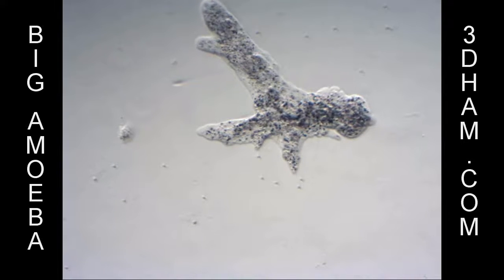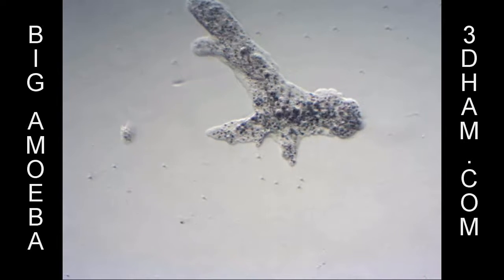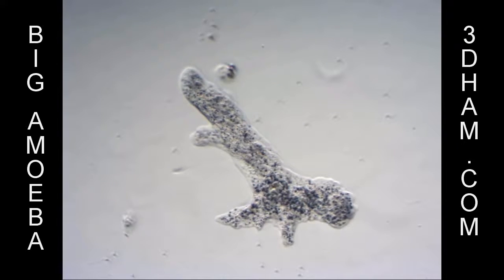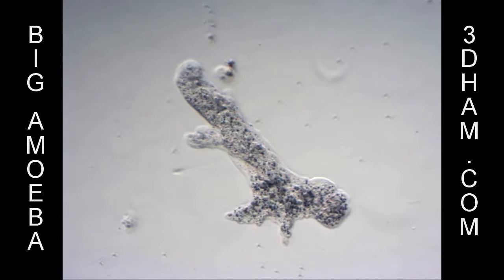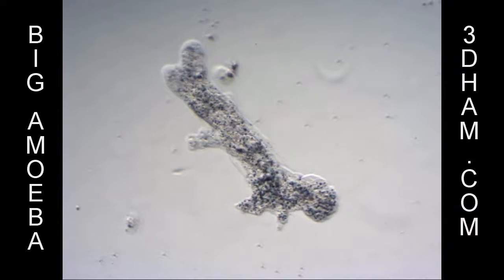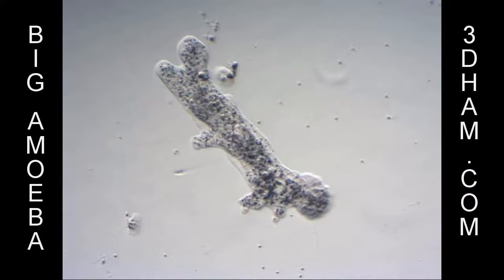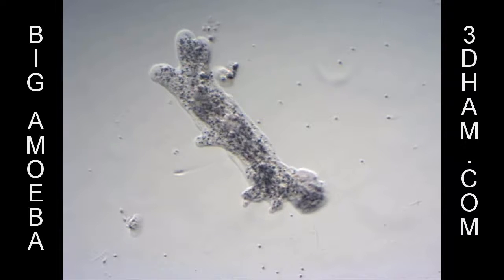It should be noted that most amoeba are much smaller than this specimen. At this magnification, you might expect to see a dozen or more on the stage at the same time. Indeed, if you let a hay infusion go long enough, you'll find that the amoeba, which are fairly rare when it first starts out, become increasingly common as the hay infusion matures.